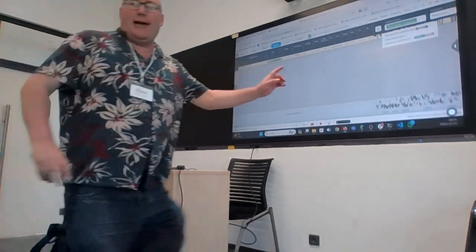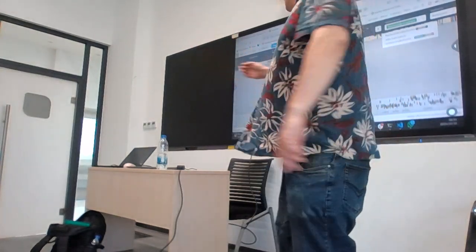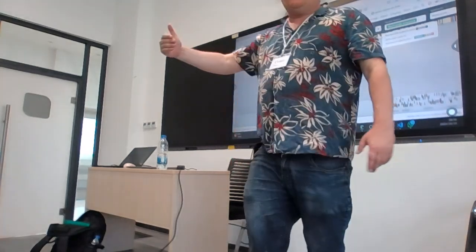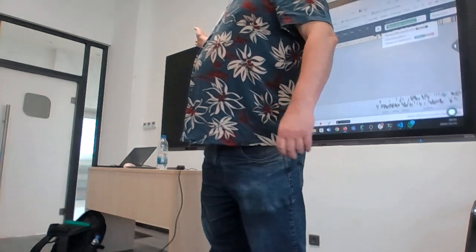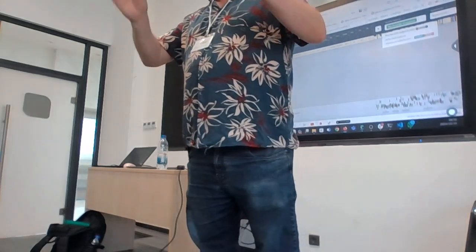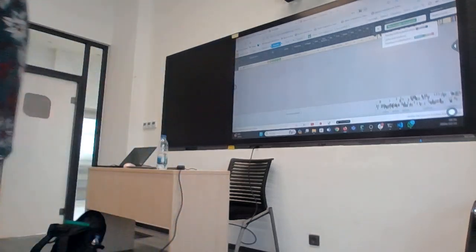The position is slightly different because the reference that they're using is a slightly different reference. You're right, Stephen, you can load your own reference into nextclade for this analysis, but I wanted to just show that what you see in the VCF, the variant, shows up in nextclade, broadly speaking. Okay?